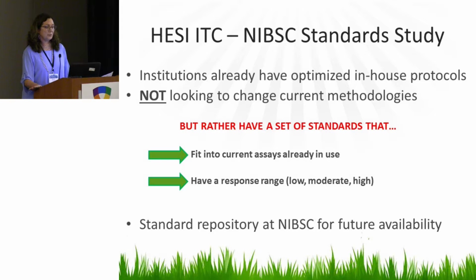So the institutions already have optimized in-house protocols, which is why we're not asking people to try and come up with a standard assay or change their current methodologies. But we do need to have a set of standards which can fit into the current assays that are already used. And we're also looking at a response range, so low, moderate, and high responses, and that will help us compare our own molecules to those types of responses and at least have some idea how severe a reaction might be.